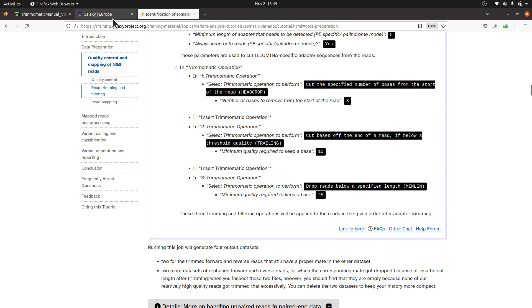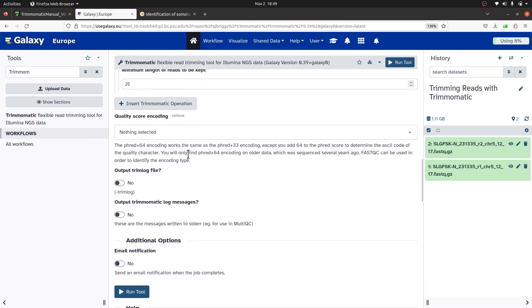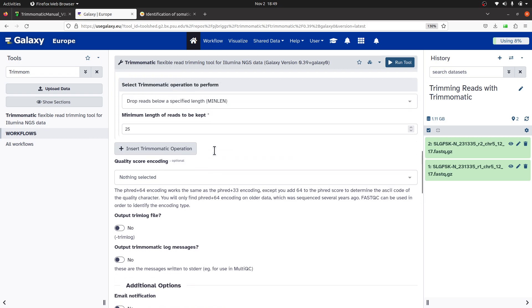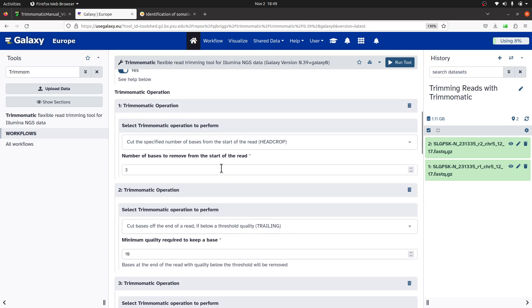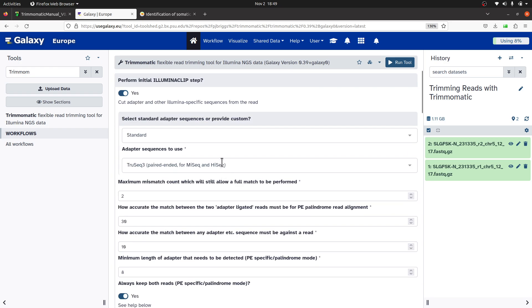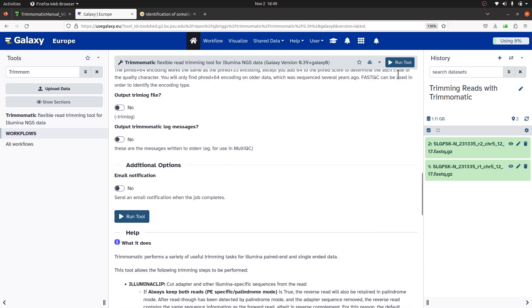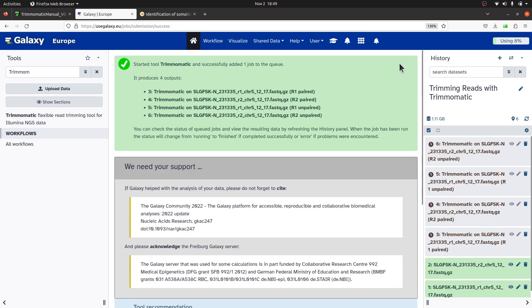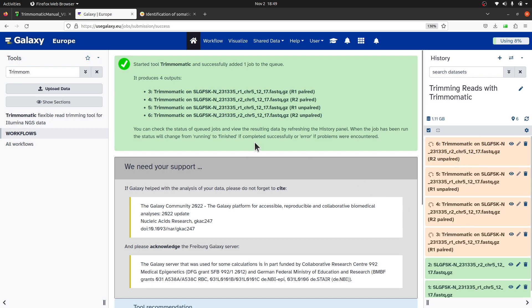There are other operations you can also perform depending on your needs, but for the most part these three should serve our purpose. This is meant to introduce you to Trimmomatic on Galaxy — once you know your way around you can always fine-tune the settings. Now we click Run Tool to execute. Galaxy automatically specifies the output file names, so all we have to do is wait for the files to be generated.